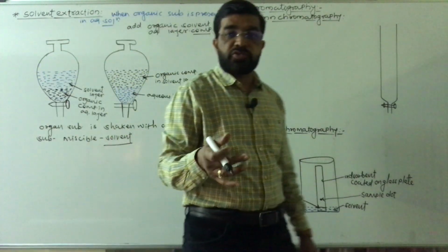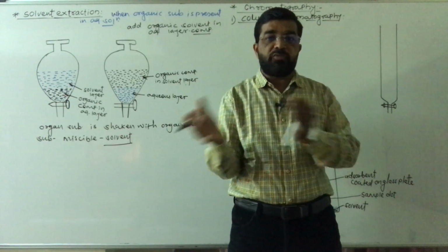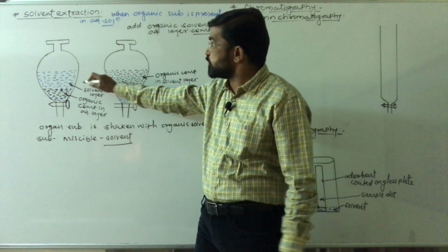That means the substance has to be shaken with the organic solvent in this funnel. This is the solvent extraction process.